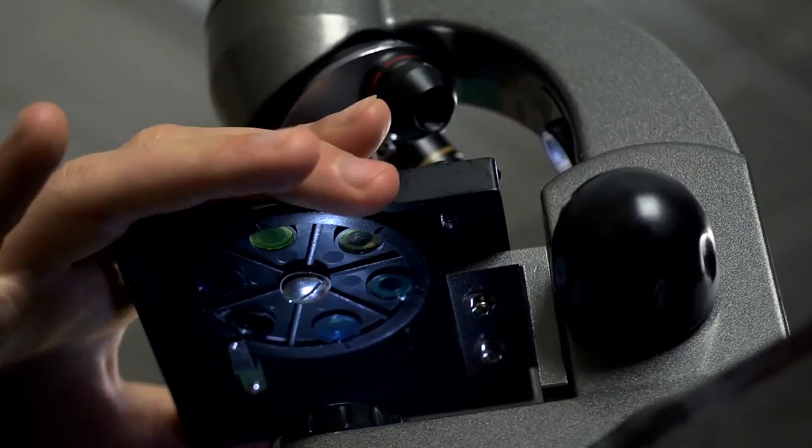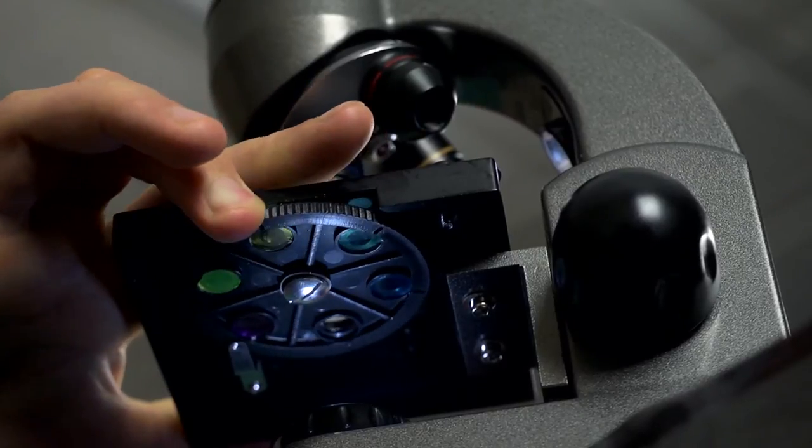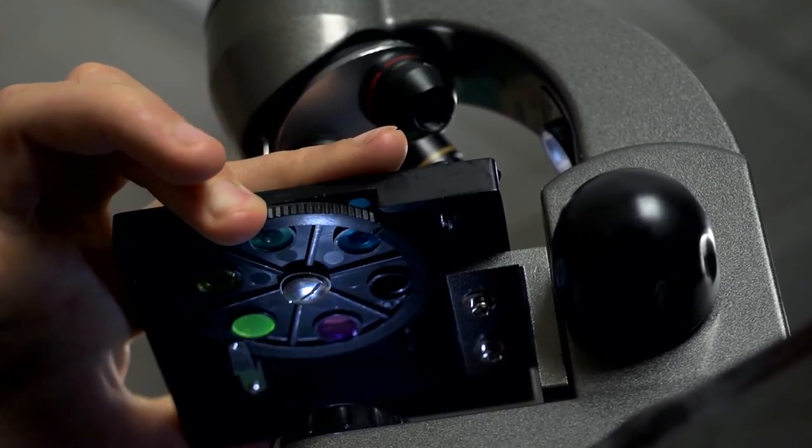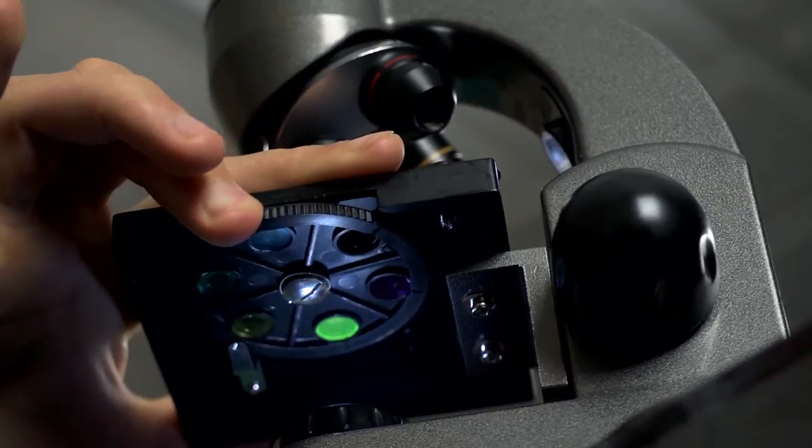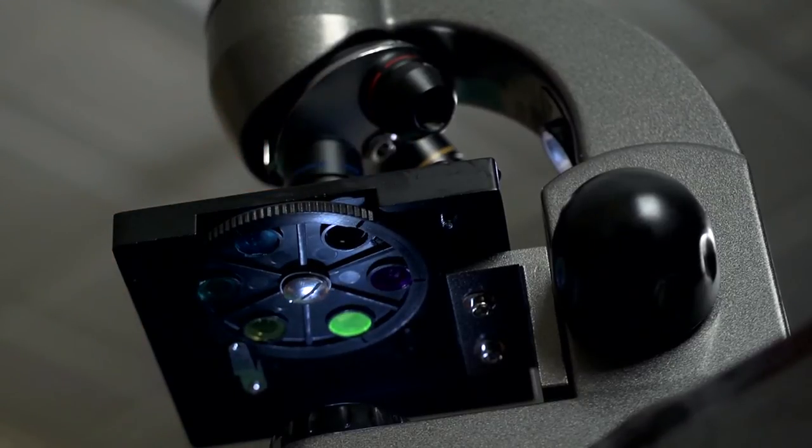Included with this microscope is a built-in color filter wheel. With this feature you can choose from five different background colors or choose to have no color at all. Depending on what you're viewing, certain filters will allow you to get more detail out of your specimen.